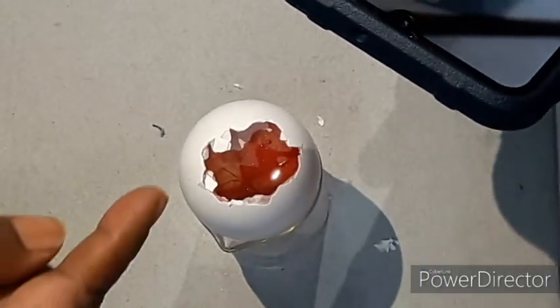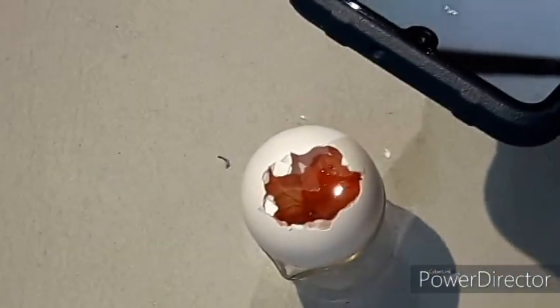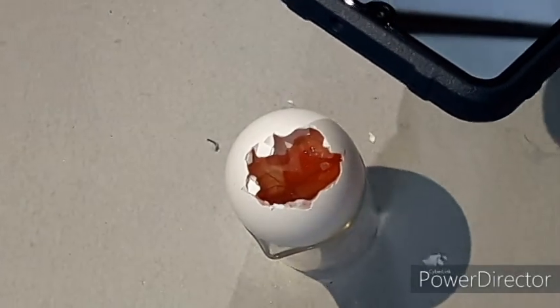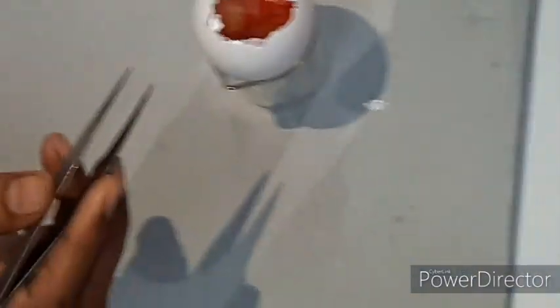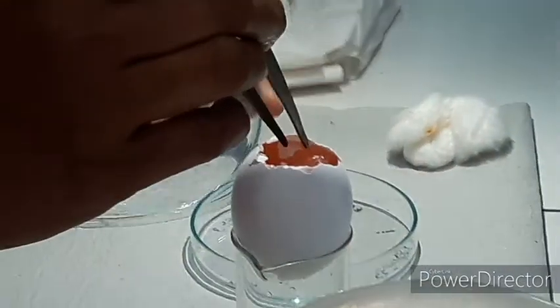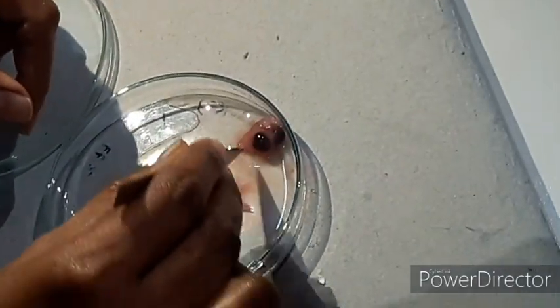The embryo movements can also be recorded. We have to very carefully remove the embryo from the egg. With the help of a sterile forcep, we have to remove the chorioallantoic membrane as seen in the video and then remove the embryo.